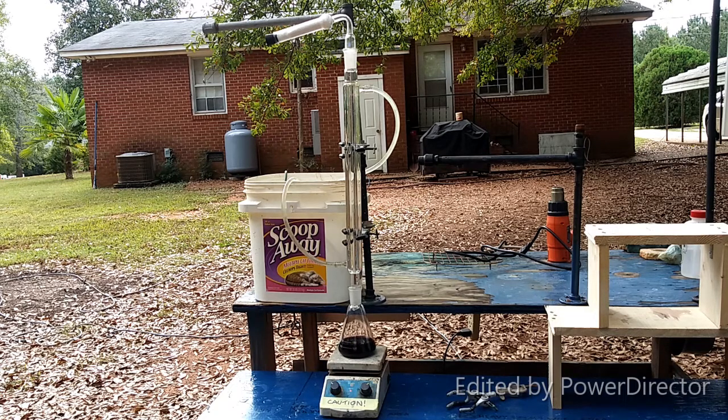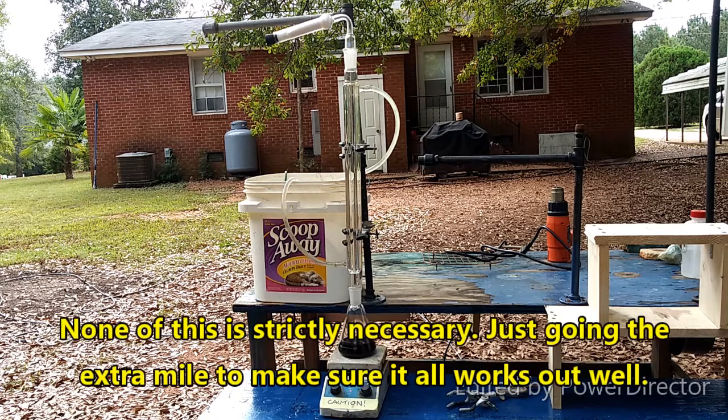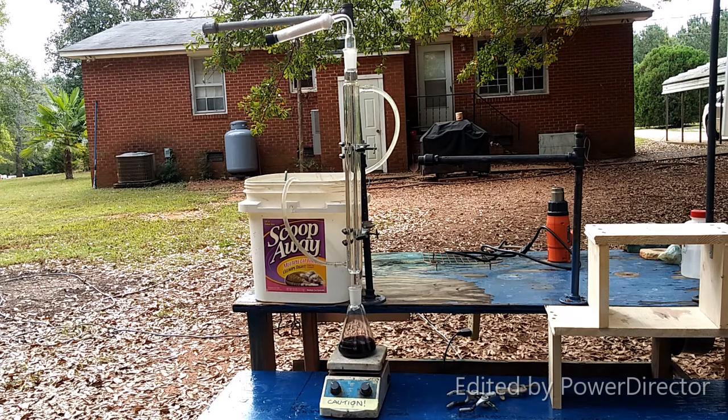I dried out the flask and the column by rinsing them with acetone and then drying it thoroughly with the heat gun. The calcium chloride in there is fresh. I mean, the toluene was not pre-dried, so there is a little bit of water in there, but I don't think it's going to be a big problem.